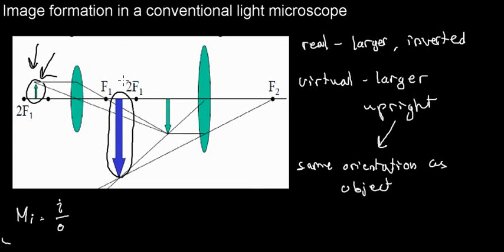This is good. So again, just to recap everything, what we have here is an object placed in a specific orientation that causes it to form a real image. This real image now becomes the object, and its orientation causes it to form a virtual image. And this end image is considerably larger and inverted. And this is what we have. This is what we need.